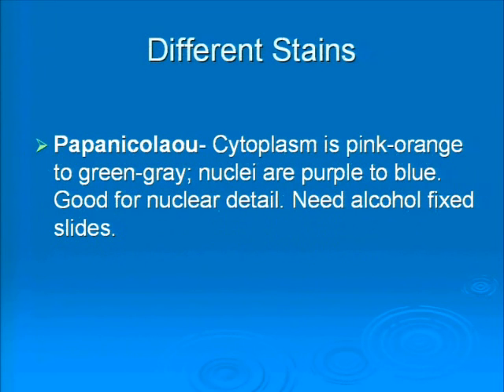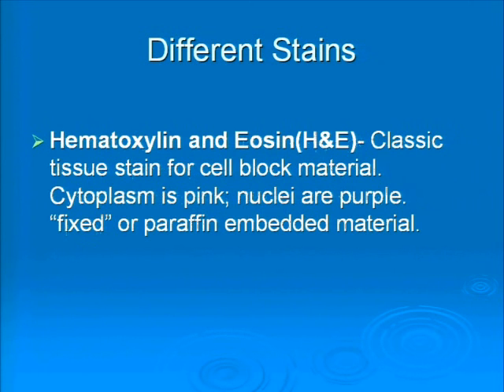The pap stain, on the other hand, you need to put into the alcohol right away. It's something that's going to come out either later that day or the next day. And the thing that we really like about it is that all those grooves and inclusions that you hear us talk about for papillary thyroid cancer, that's where we can see them the best. So pap stains really help us confirm those great nuclear details that we all look forward to seeing for papillary thyroid cancers.